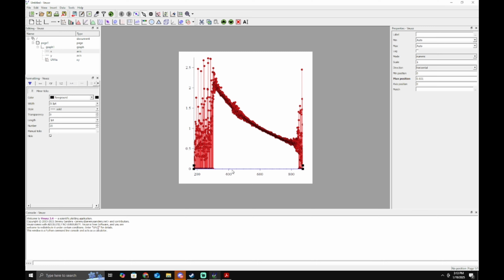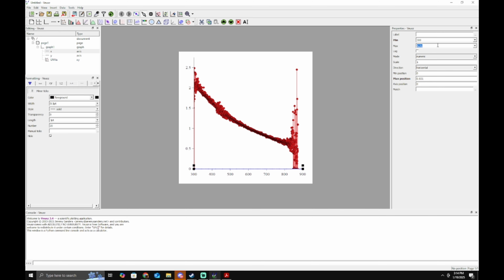And same thing, we're going to go to wavelength and change it up. So you can either click on these or you can click on them in the graph space. And same thing, I'm going to go back over to my properties tab and just cut it down a little bit. So we'll do 300 to 800. And now we can see we have this decay curve. You can go a little bit further out, but really just preference here. This is a fine range for it.